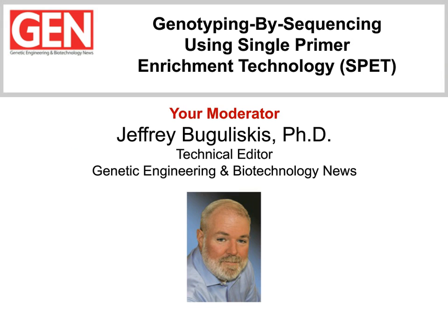Next-generation sequencing technology continues to dominate genomic sciences, driving sequencing costs down to levels where the sensitive technique is becoming a practical solution for all types of high-throughput studies, such as genotyping by sequencing. However, addressing genomic complexity still remains a challenge when performing targeted sequence analysis, and companies are developing tools to tackle issues currently facing genome investigators. Let's meet our panelists for this GEN webinar, who will discuss the novel approaches for targeted sequencing of DNA that is suitable for a wide range of genomic targets.